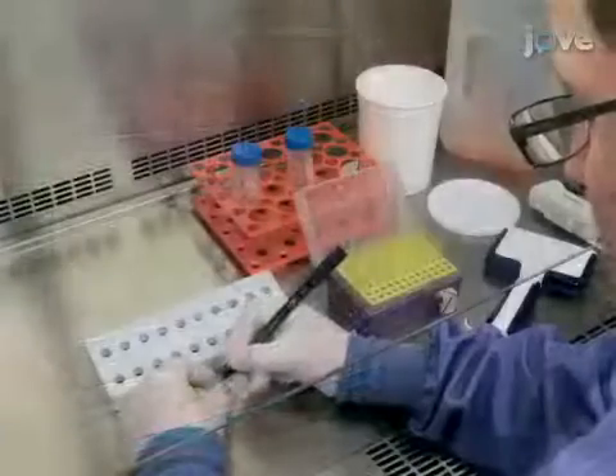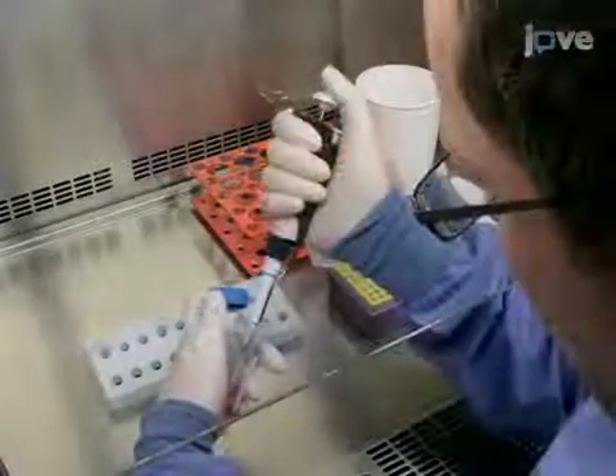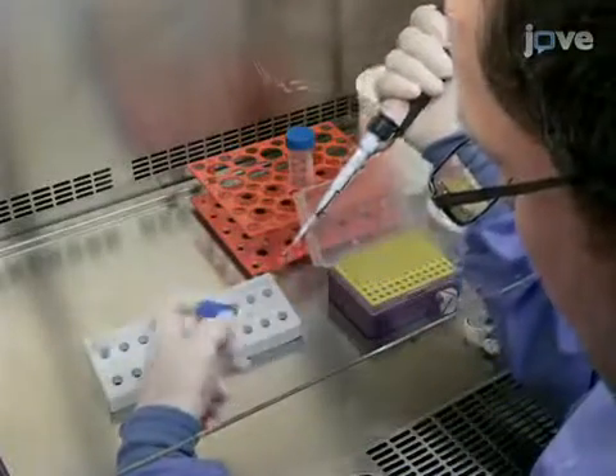On the following day, prepare the transfection mixture. First, set out two tubes, tube A and tube B.